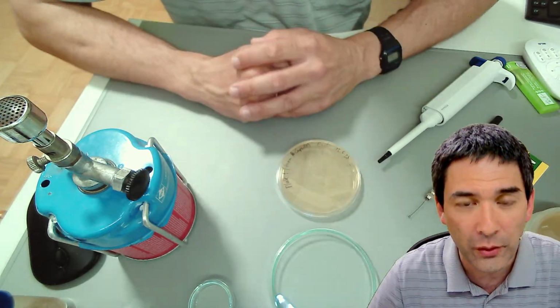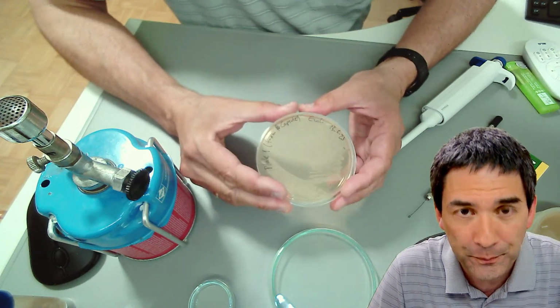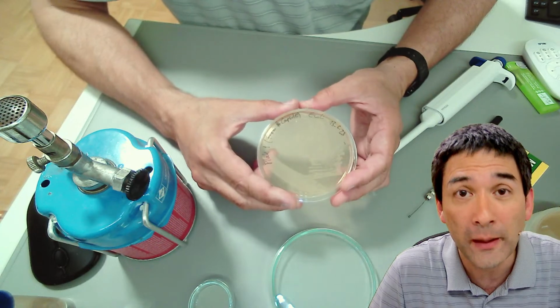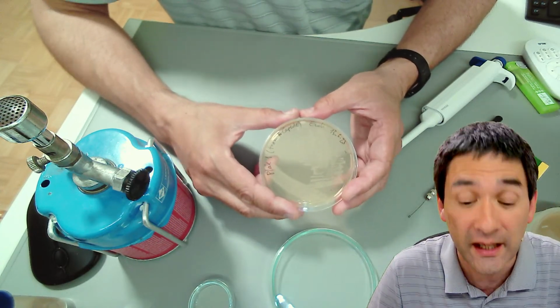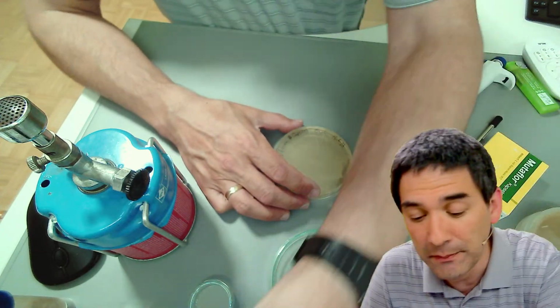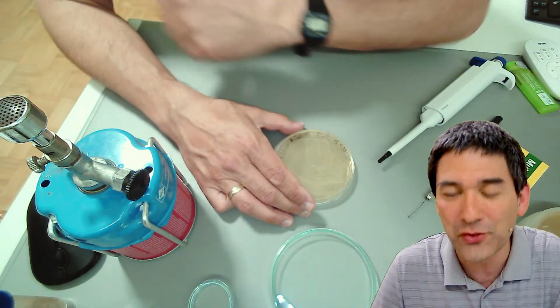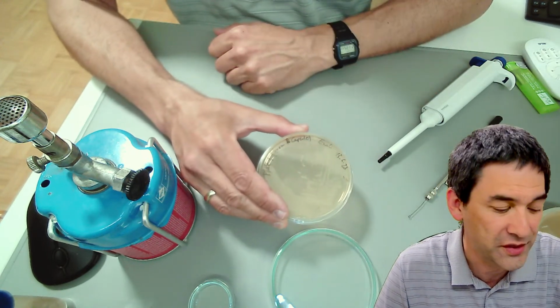A short overview. Number one, I'm going to show you how to grow bacteria on a petri dish. Number two, I will be putting them under the microscope. I'm also going to show you how to heat fix bacterial slides, and I will also be staining the bacteria with a methylene blue solution. Okay, and I think that's going to keep us quite busy. I also have a new stereo microscope standing next to me, where I'll be showing you some of the bacterial colonies here.